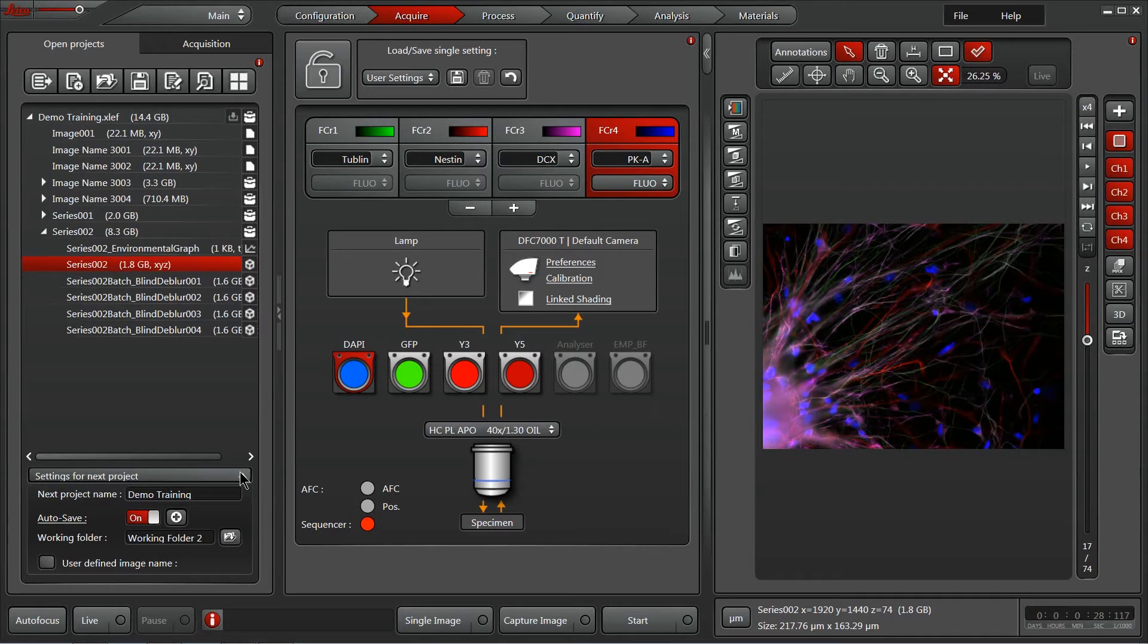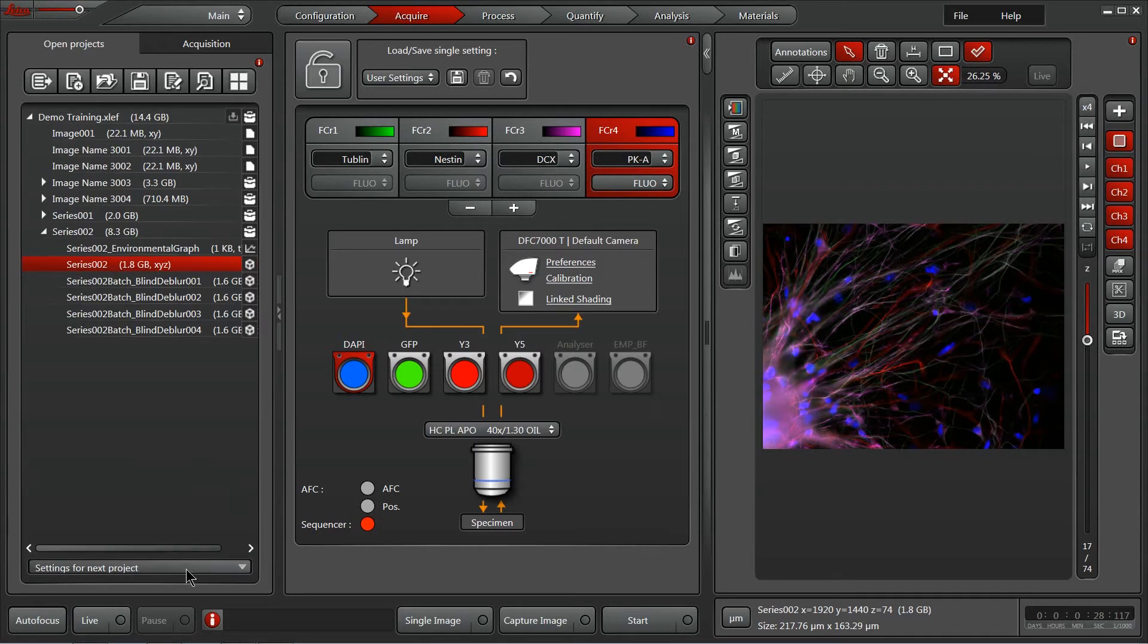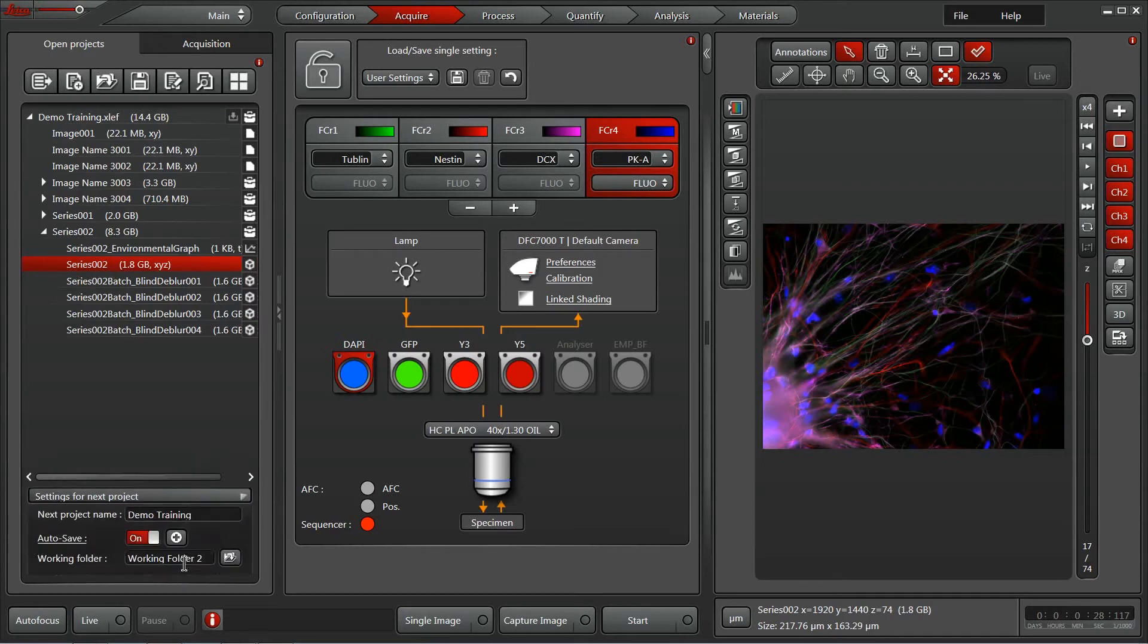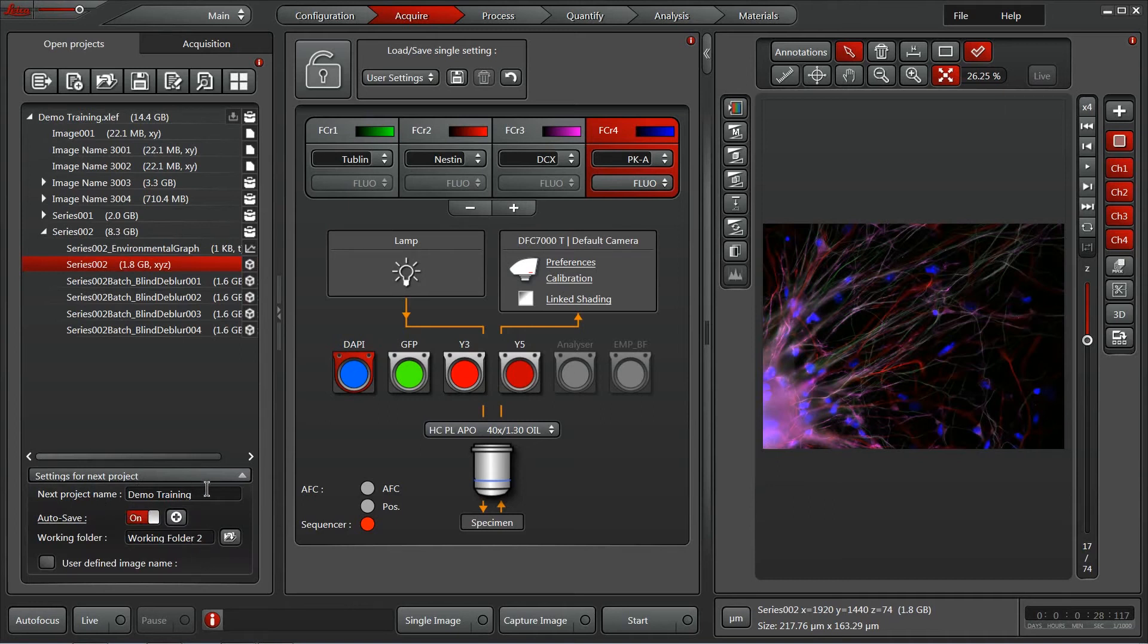Also, here on the bottom, we've got a settings for new projects tab within which you can actually activate an autosave feature. I like this because I like to have things automatically saved.